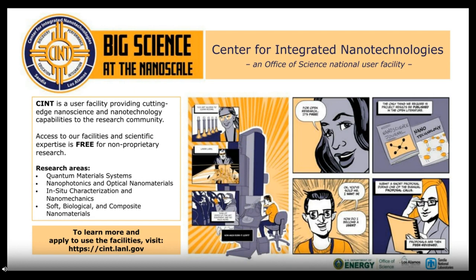CINT is a user facility. We're funded by the DOE, Department of Energy. So access to our facilities and scientific expertise is free. Access to this cryo-EM lab is free for non-proprietary research. It just requires the submission and acceptance of a 2-page user proposal. To learn more about the facilities, please visit cint.lanl.gov.